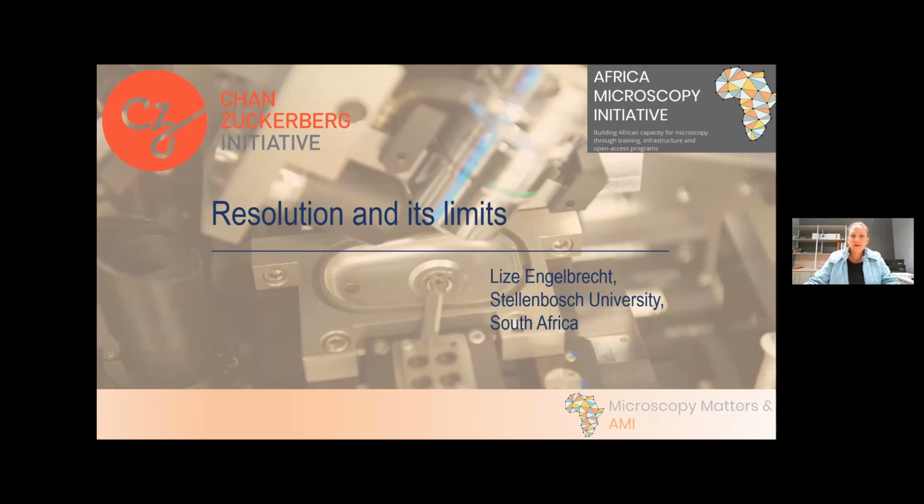Today, we will be talking about the resolution of light and its limitations. Let's quickly look at an overview. We'll talk about what resolution is, the differences between optical resolution and spatial resolution.